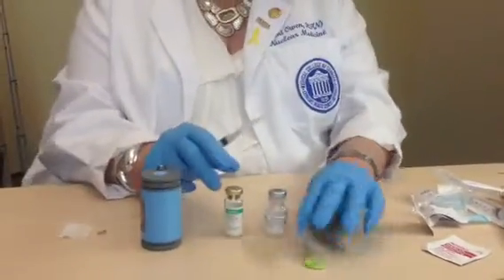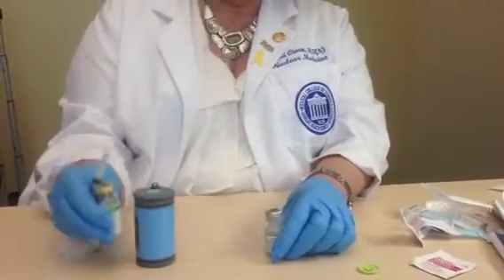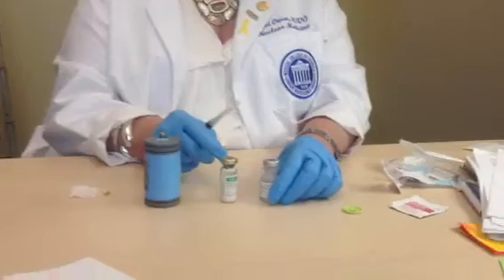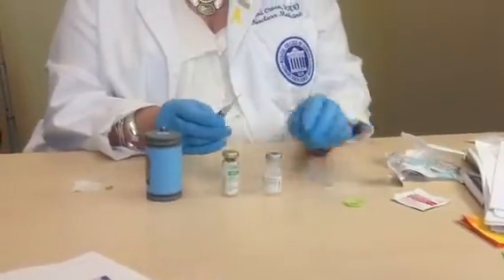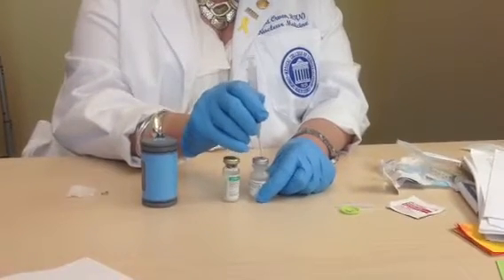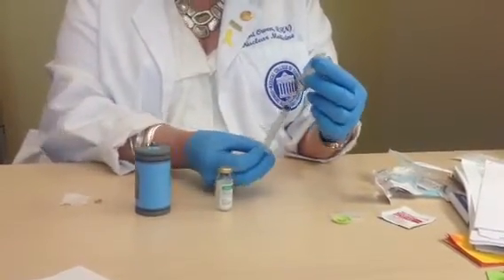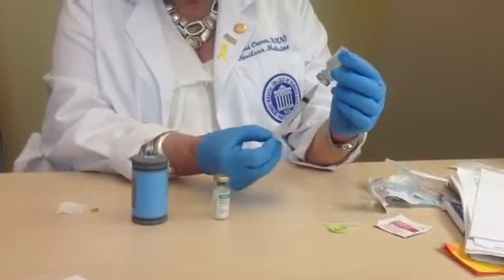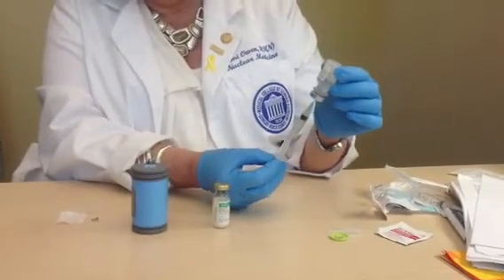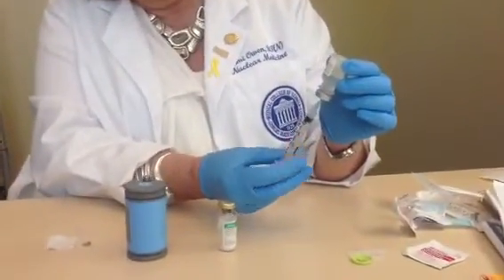Okay, and so remember, if we were actually doing this, both of these would actually be shielded. We would put the kit into another vial container, because when we add radioactivity to it, it will then be radioactive. So then what we're going to do is to plunge the needle into the center of the rubber stopper, and with our thumb and index finger, we're going to make sure the bevel is fully immersed in the fluid, and we're going to just draw out 2 cc's. I can see that I have 2 cc's right there.